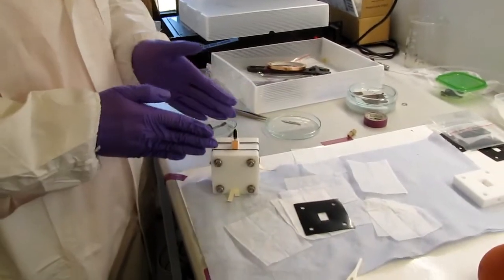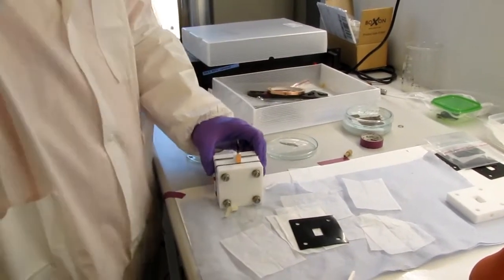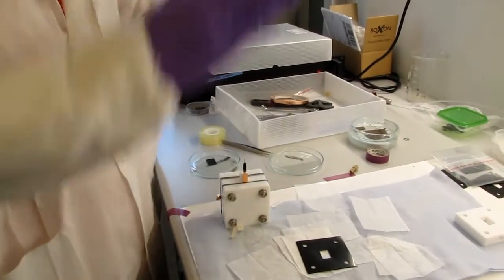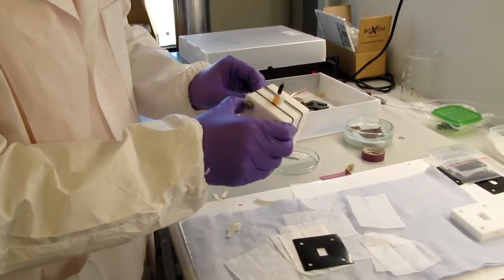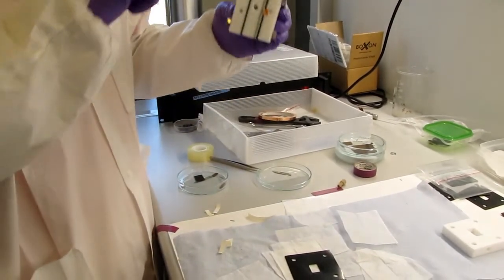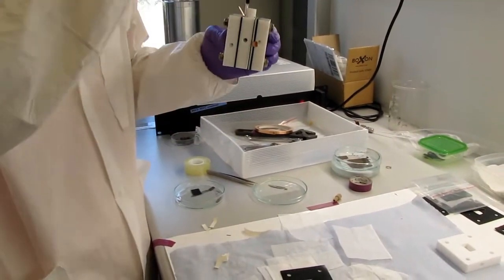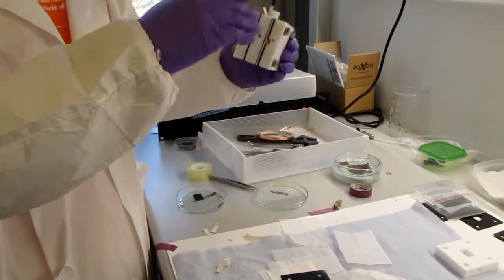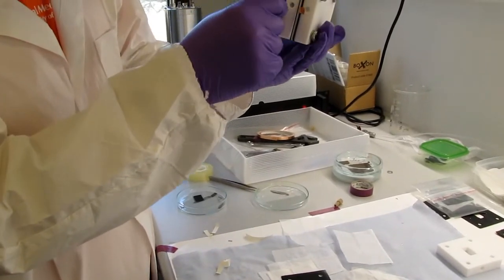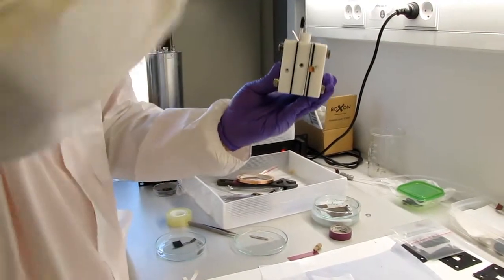The gas will normally not go to the electrolyte side because the GDE is there. It's hydrophobic. Of course, if your GDE is slightly damaged, you may have a little gas penetrate, but most of the time it just stays in the gas chamber. After reaction, some gas products also transport through the gas chamber and are vented out.